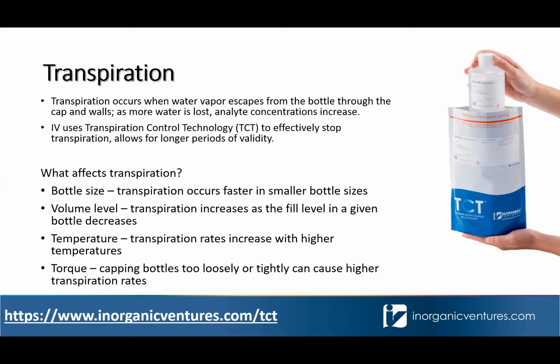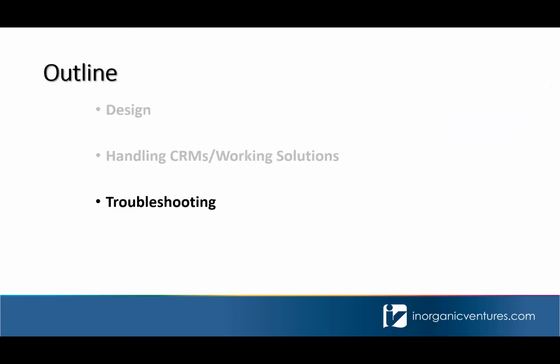1-year usage period. Okay. So in the remaining time, what I would like to do is shift into the second part of the presentation and use this as a discussion on ways of troubleshooting unexpected results.